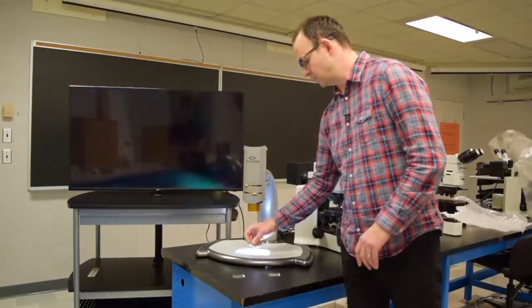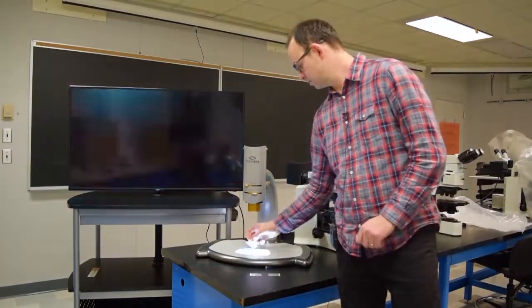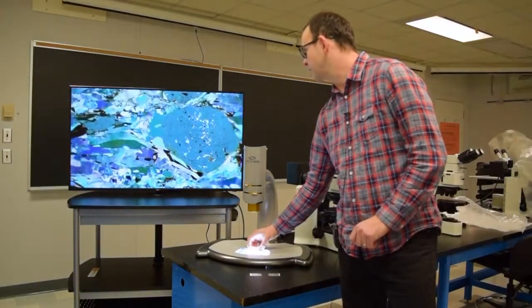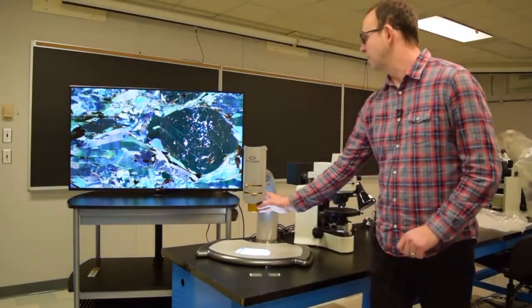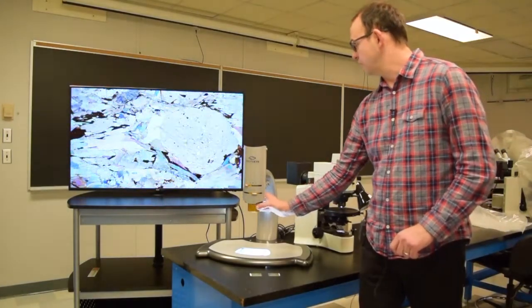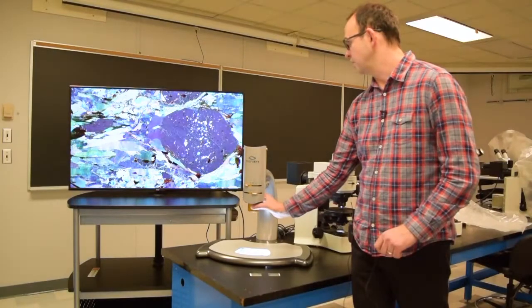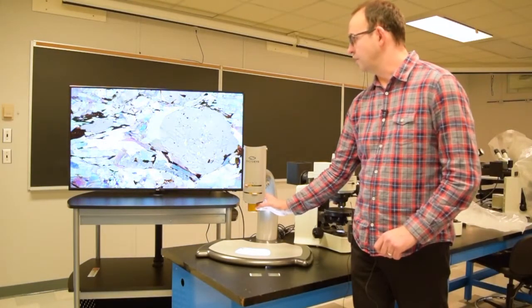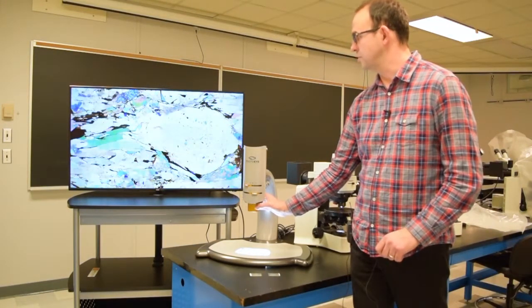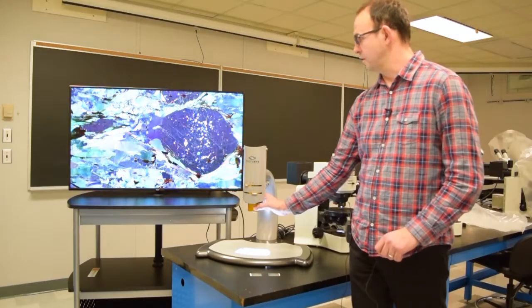We also have a metamorphic rock, in this case a garnet schist. The garnet is the large grain that turns from black to white to pale green. The very vibrant colored grains that turn into blues and reds are micas.